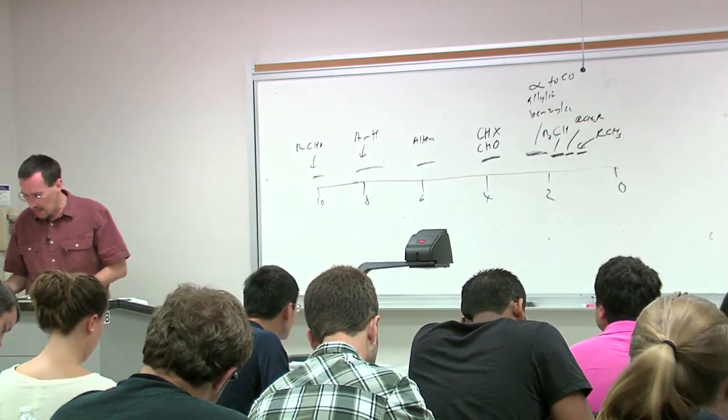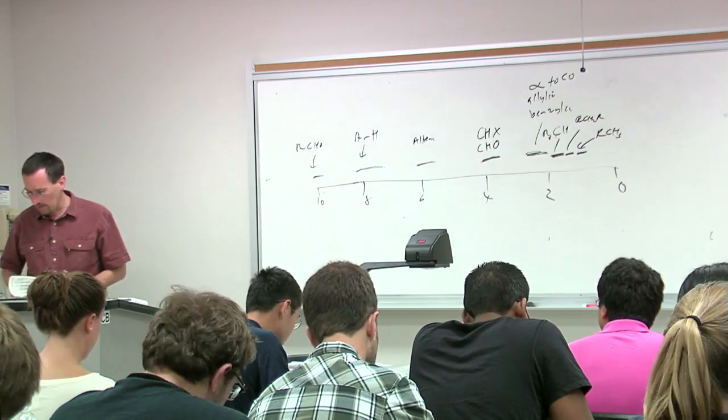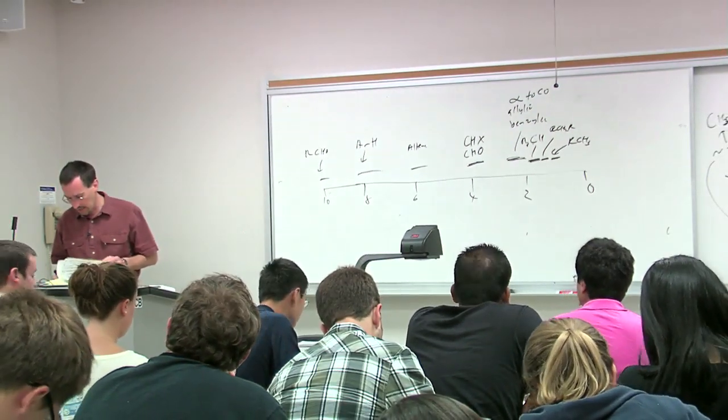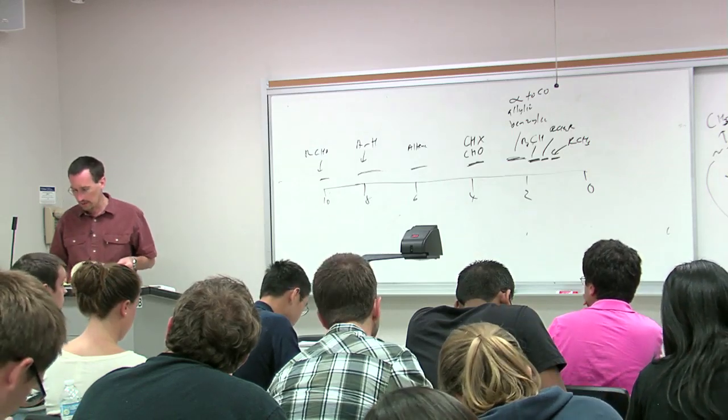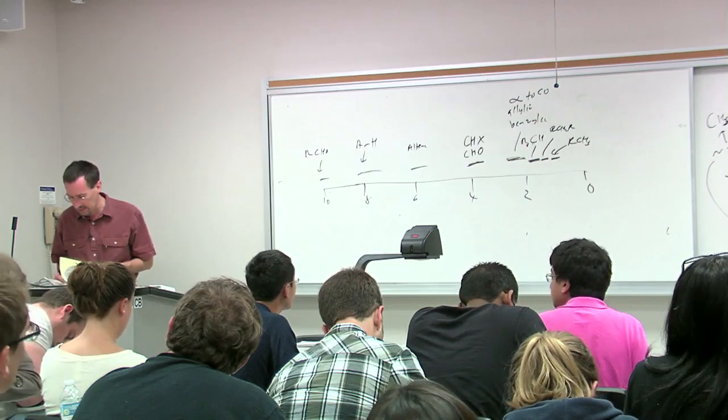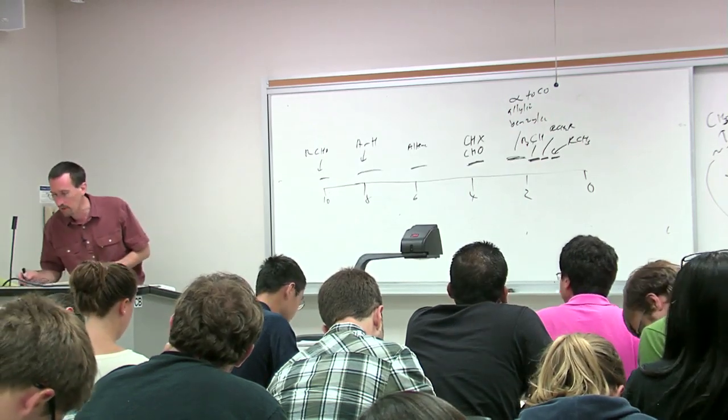All right, next time we will pick up, we'll talk a little bit about carbon NMR, and then we're going to move on to discuss spin-spin coupling and other factors that are involved. I guess next time, yeah, we'll get both of those.